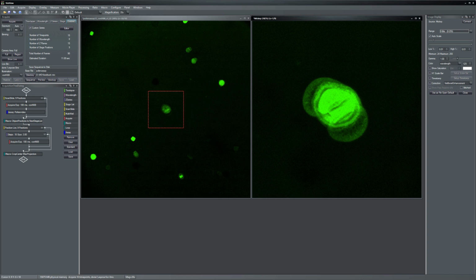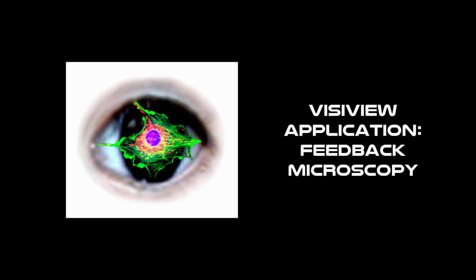I hope you enjoyed watching this video and that it motivates you to make your imaging smarter with VisiView.